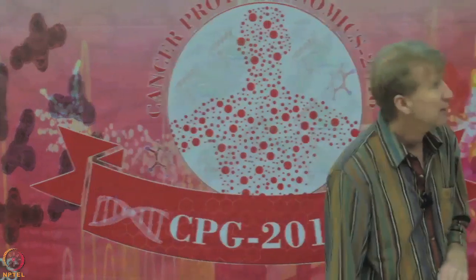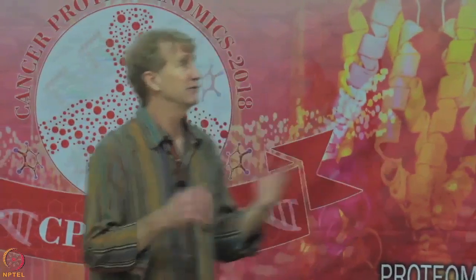So in cases like this, it's often the case that if you have to determine between two choices that are right next to each other, you're going to have to make that decision on maybe one or two peaks in the spectrum. All right, let's talk about the range of possibilities that could happen here.